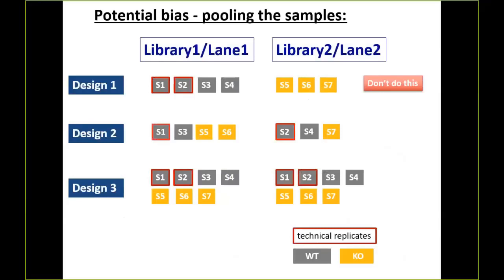So if you're looking, for example, for a 1 in a million splice variant in a transcription factor, I'm actually probably going to tell you don't do it, because the coverage you would need is going to be way out there. It's going to be one of those numbers with so many zeros that I don't know how to pronounce it.